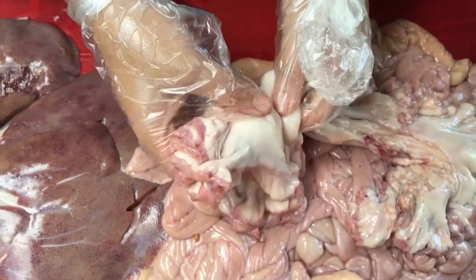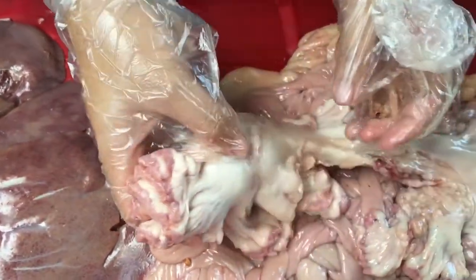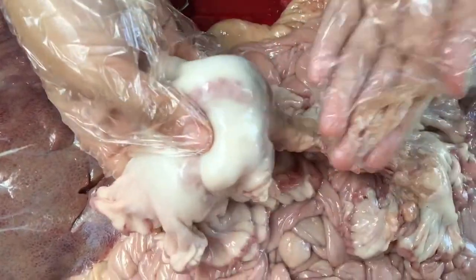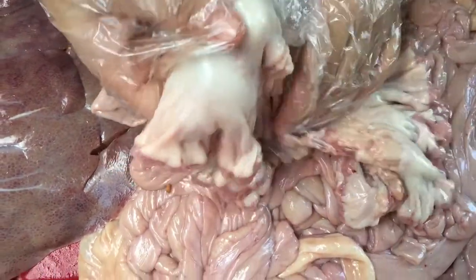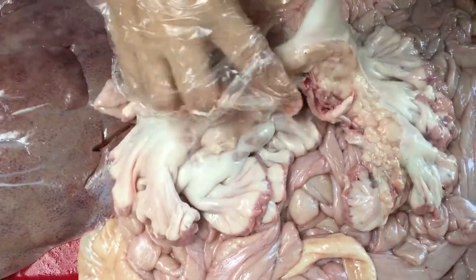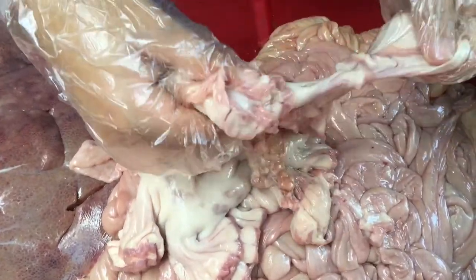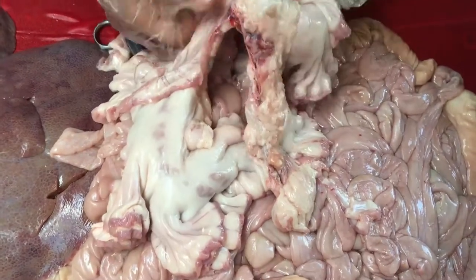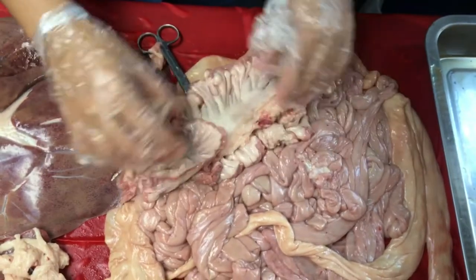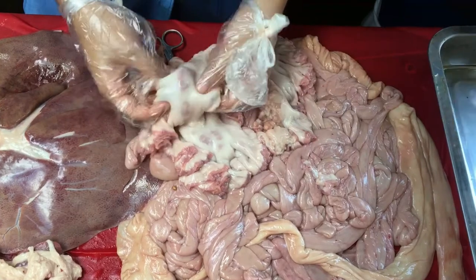It carries blood from the small intestine to the liver so that all these nutrients just digested and absorbed can be processed in the liver and then distributed to the rest of the body. The mesentery is also a very important organ, often ignored, but there are more interesting features of the mesentery called the dark patches of tissue. Those are lymph nodes.